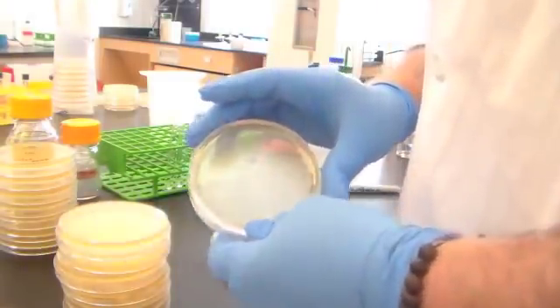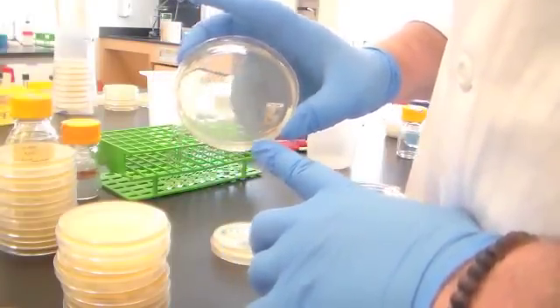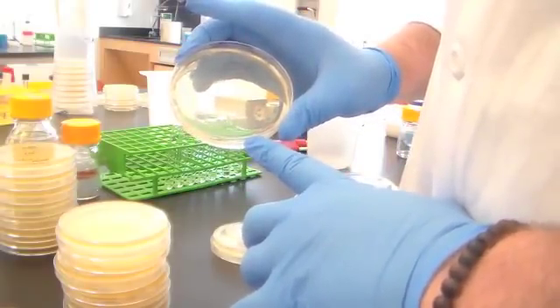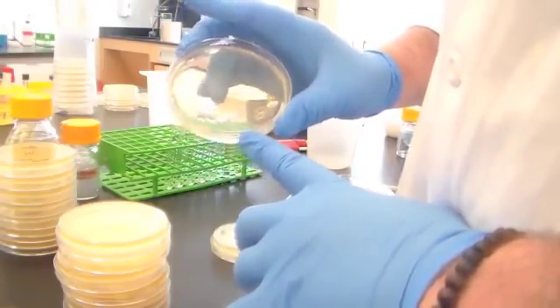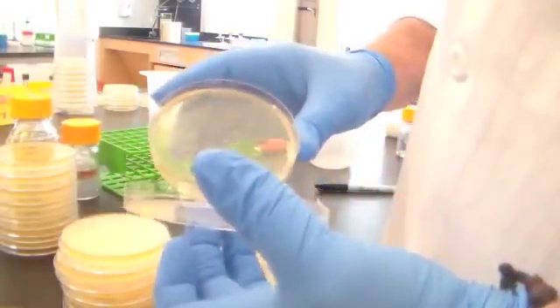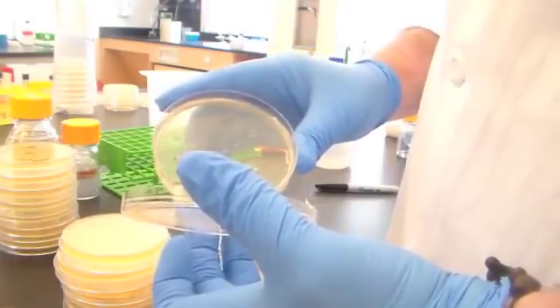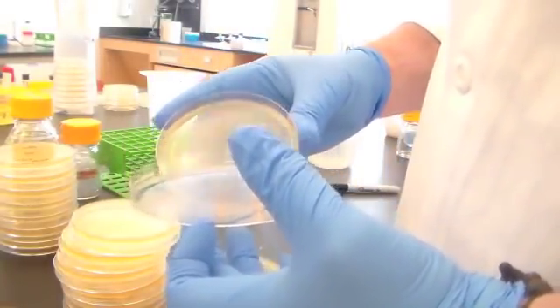If you continue on, here's the 10 to the minus 7. There are actually 3 colonies on here. I wouldn't use this to determine what the titer was, because if this were off by even 1 colony, that would be a 25 or 33% change in the results. So I wouldn't be able to trust that result as much as if I were counting 25 or 30 or 50 colonies, because then a minor pipetting error wouldn't have a major effect on my calculations. And then of course, at 10 to the minus 8, the plate has no colonies.